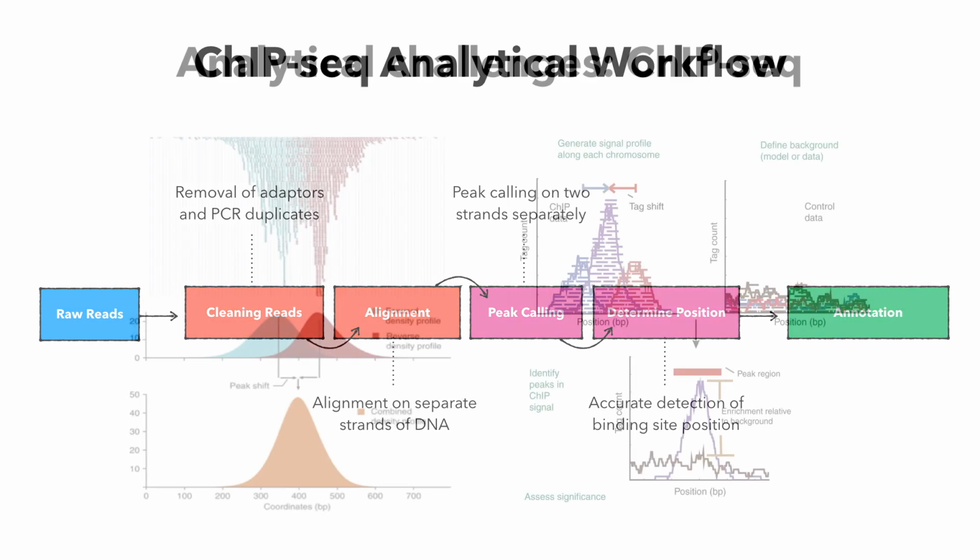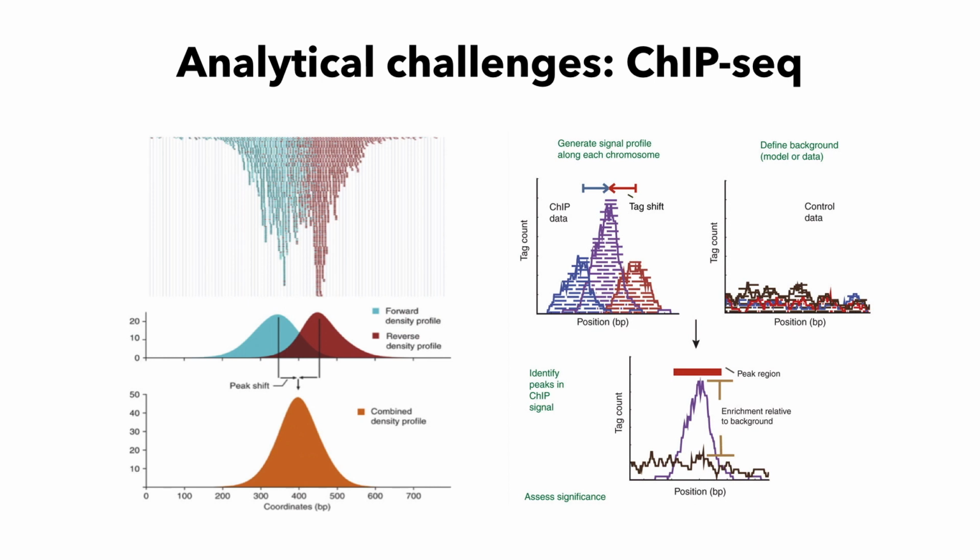The major objective of ChIP-seq analysis is to detect genome fragments that are enriched with upregulated signals. These fragments could be transcription factor binding sites, chromatin remodeling, or gene transcription events. The main algorithmic challenge is to accurately detect enriched genome fragments, generating a whole genome landscape for the signal. To do that, let's review several techniques related to peak detection and peak shift that are a part of the ChIP-seq workflow.